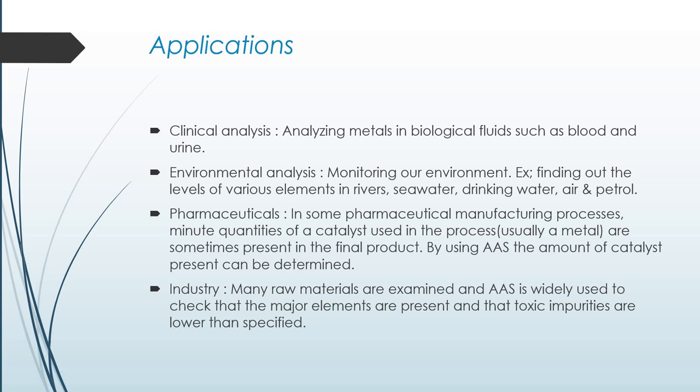Third one is pharmaceuticals. In some pharmaceutical manufacturing processes, minute quantities of a catalyst used in the process, usually a metal, are sometimes present in the final product. By using AAS, the amount of catalyst present can be determined.